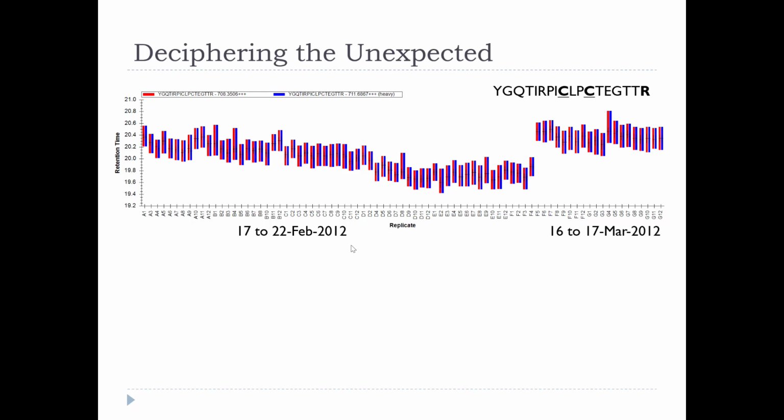Column change. I didn't hide the dates, so I put some information in here that you wouldn't necessarily have. If I'd done this, then I could go, whoa. And I didn't know this. I just started with this data, and I went, whoa, what happened to the retention times there? And it turns out that they were collected a month apart, so it's probably a different column.